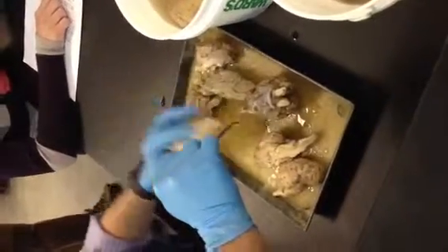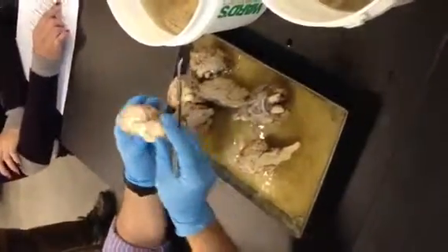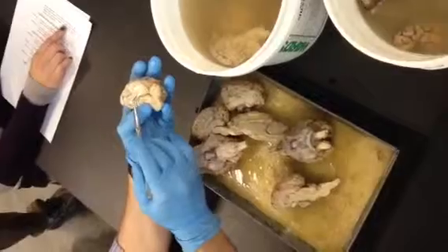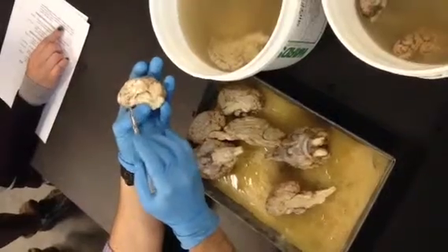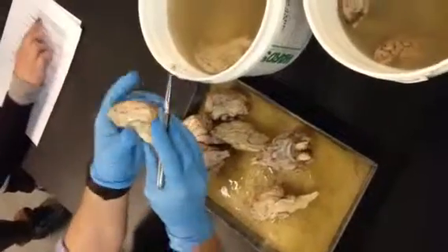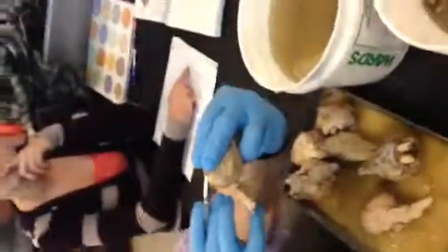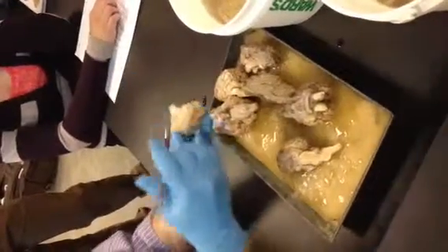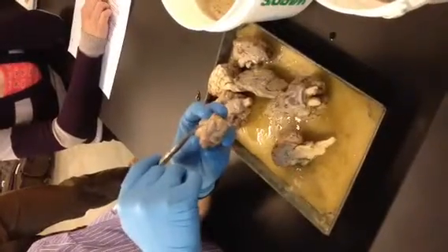Corpus callosum. Right. Corpus callosum, callosum, same thing. Very good. So the best way to do this, I'll hold it like this so everybody can see initially, is that the lateral ventricle is right here. There's an upper lip to the mouth and a lower lip to the mouth. Okay? That upper lip right there is the corpus callosum. The lower lip is called the fornix. So I open the mouth, upper lip is corpus callosum, lower lip is fornix. I can open this up again so you can see, but upper lip, corpus callosum, lower lip, fornix.